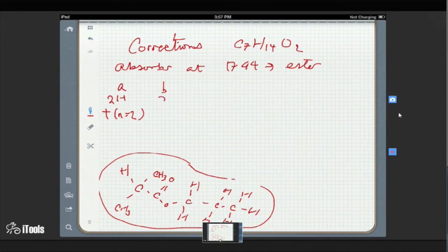I will give you a little bit of help with this. So what's wrong with the picture you have at the bottom? A lot. Actually, I don't know, I think this might be right. I think the CH3 at the end shouldn't be at 2.